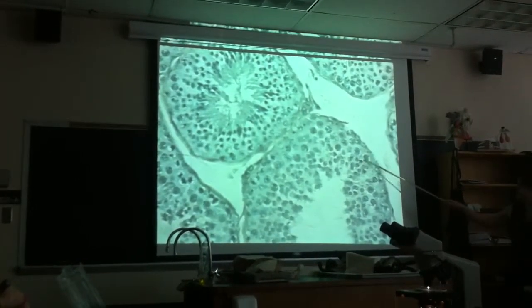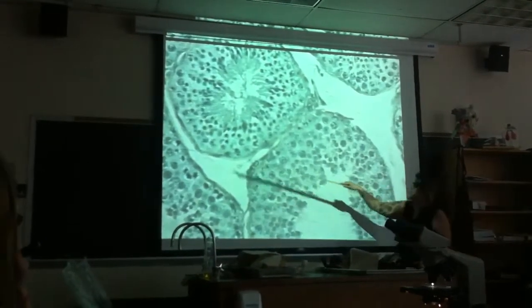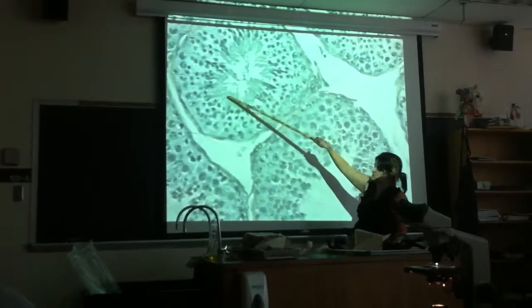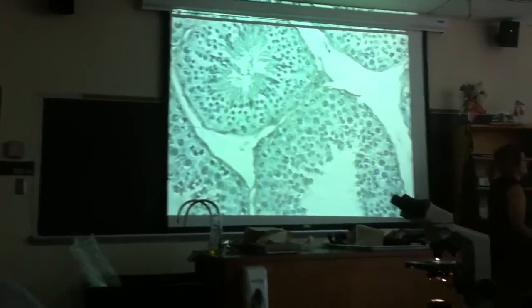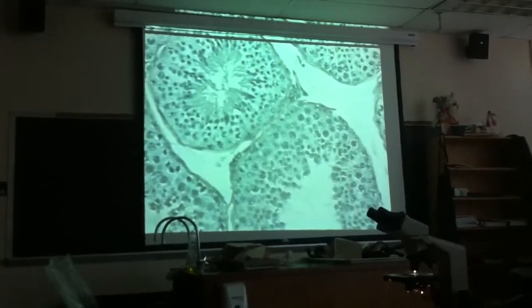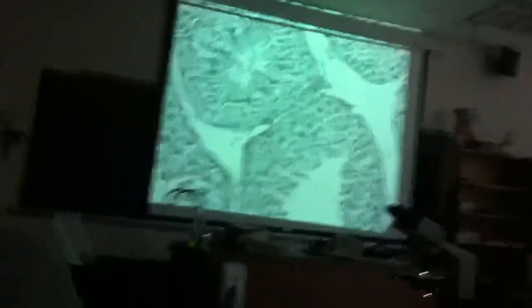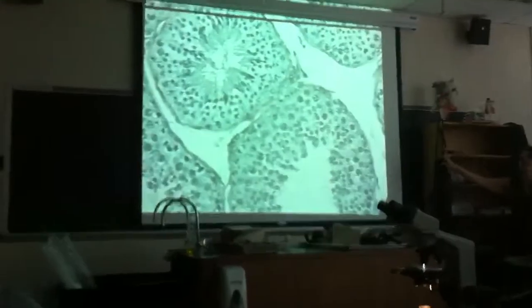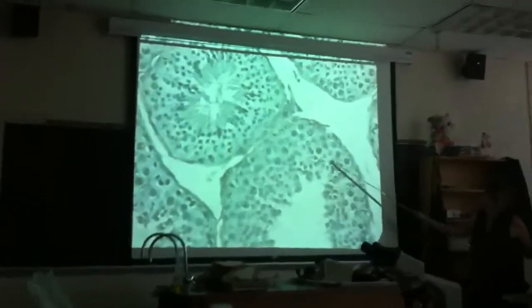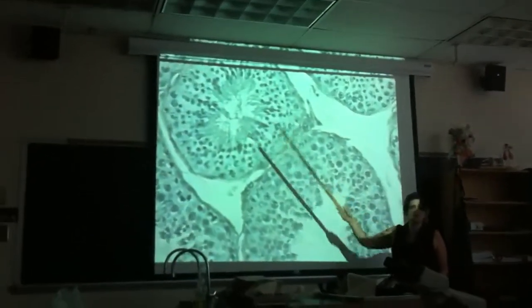So spermatogonia are closer toward the outside, these large black dots. Then as you move toward the inside, some of them will have the spermatids, which is this dark stringy material. So with this slide, if I'm wanting you to answer spermatids or spermatogonia, I have to zoom in to at least this magnification and point it here, or point it in this cloudy stuff.